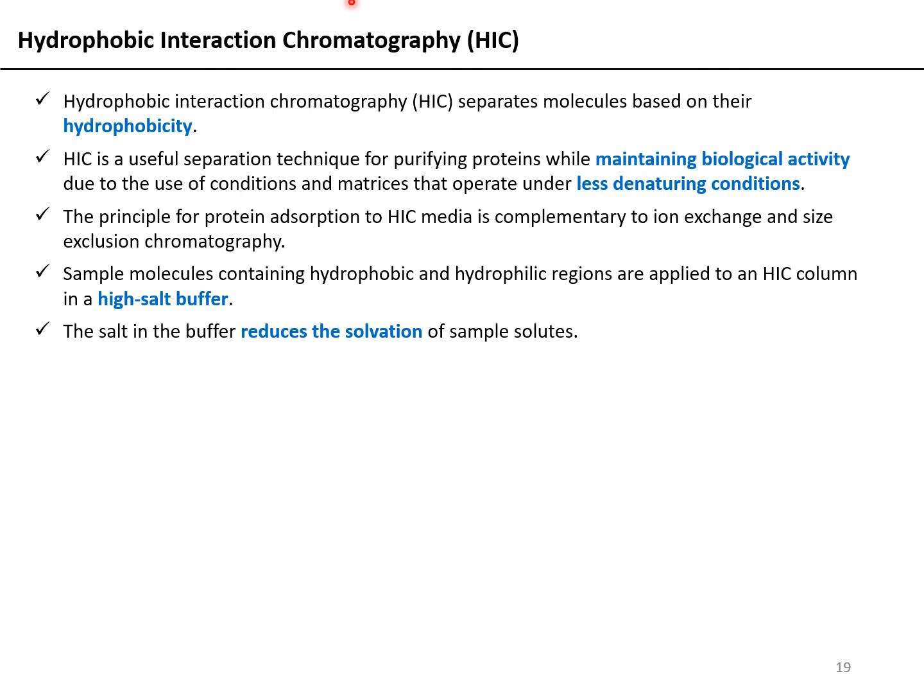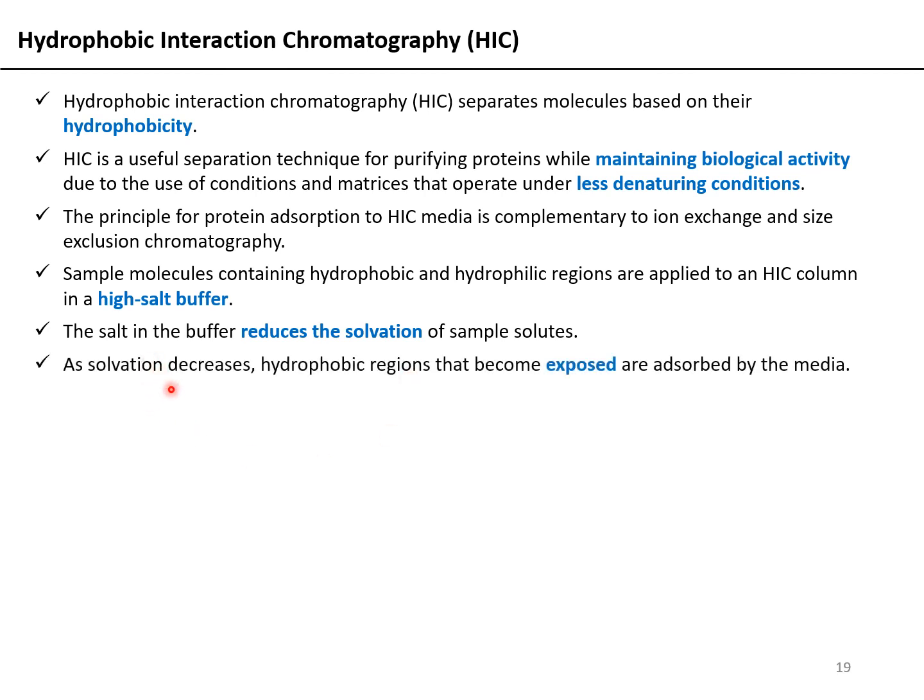We have already discussed this in the previous lecture, where we were talking about salting in and salting out, and how differences in salt concentration can affect the solvation of protein molecules. At higher salt concentration, the solvation of your protein of interest is reduced, and this leads to exposure of the hydrophobic regions. As solvation decreases, hydrophobic regions become exposed, which are then adsorbed by these HIC columns.